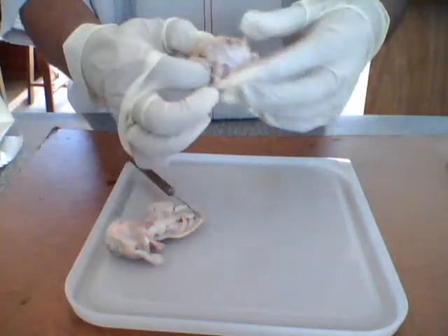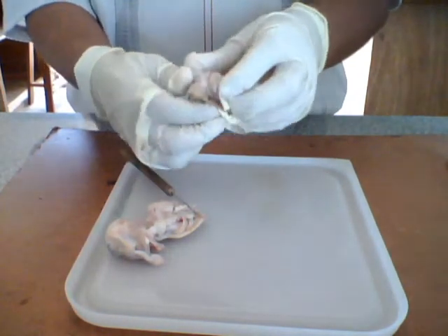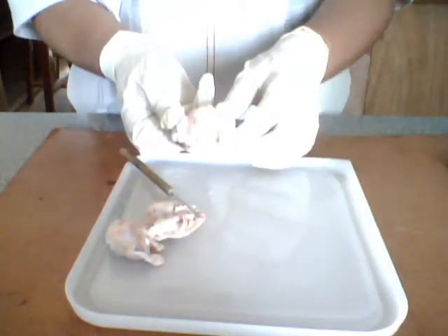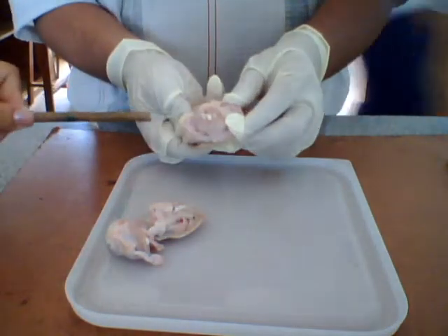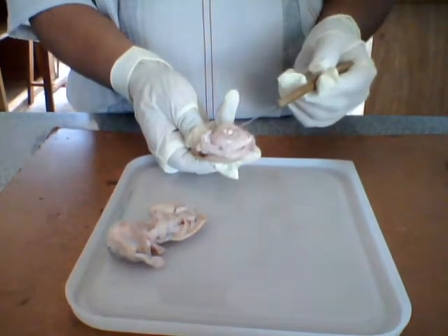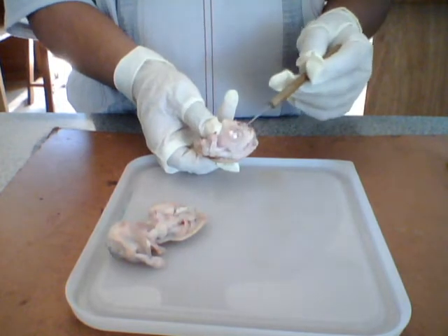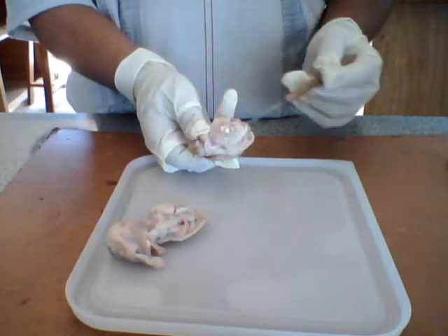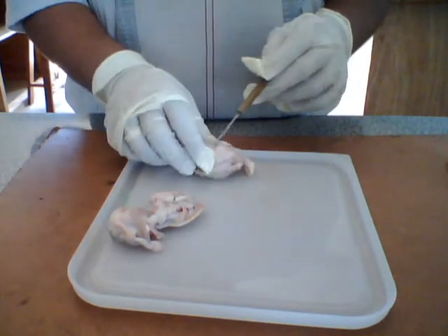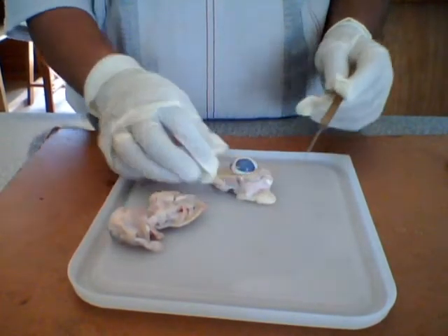Can you see where the optic nerve is, or where it used to be? This is the back part of the eye. Right there you see these two white fibrous structures — this is the surrounding of the optic nerve, and this right here is the optic nerve. We also have some muscle here that gets in charge of pulling the eye within the axis of the skull of the pig.